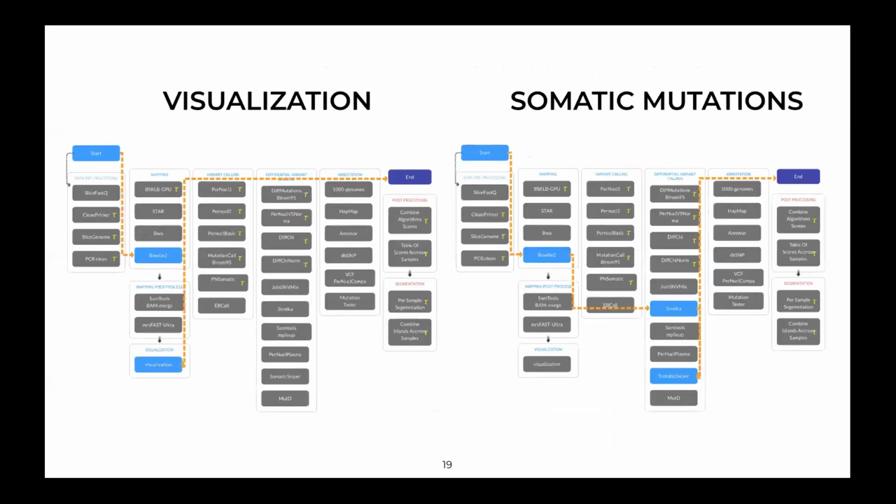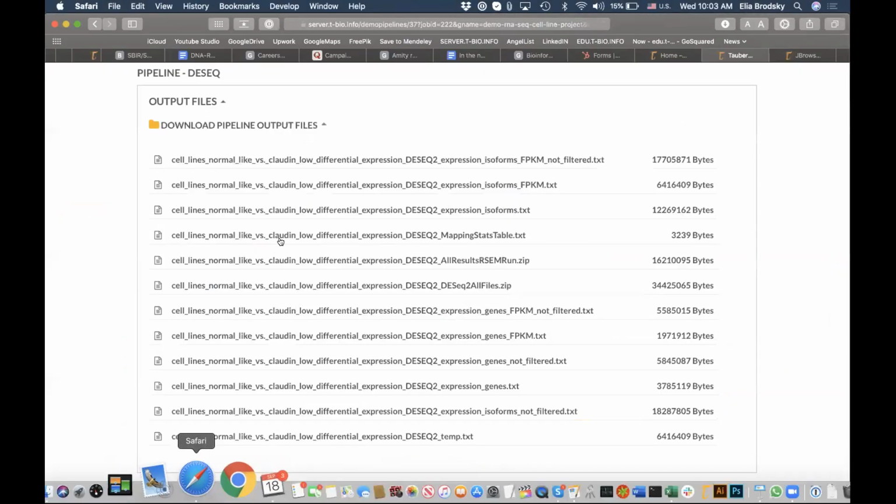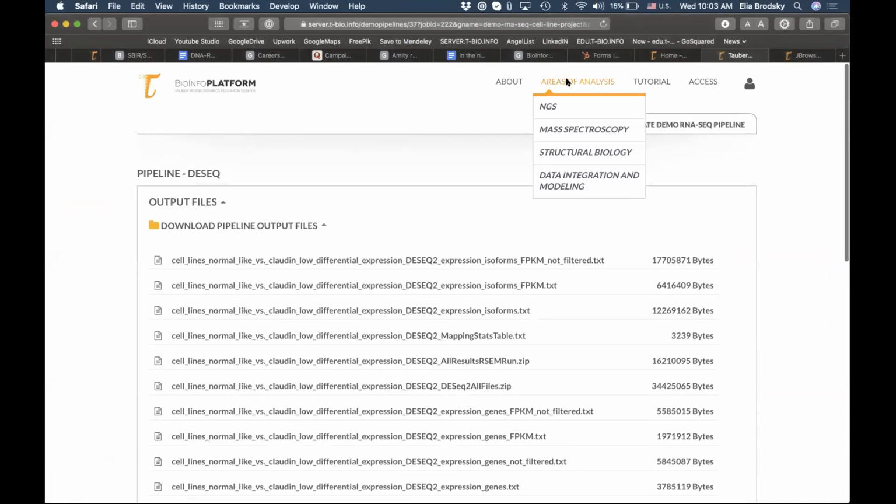Here are a couple of different pipelines that could be created to look at the data from different standpoints. Let's try and create those together so that we understand what type of information we can get out of them.